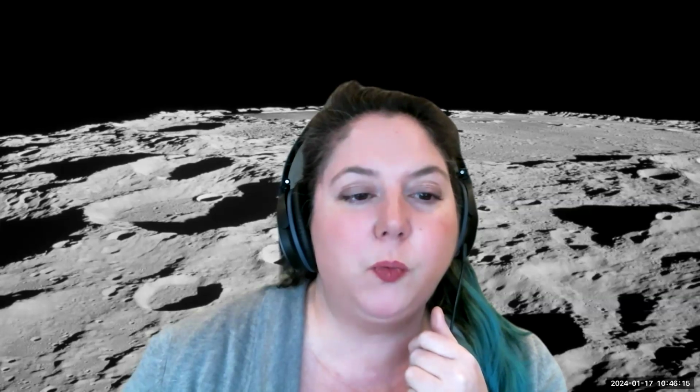Yep. Okay, there's another good question. Is there a rule of thumb for the minimum number of standards you would usually use to create a MAN background? I think setting up and getting comfortable with this technique is what people struggle most with at the beginning. And then I let you answer it properly.